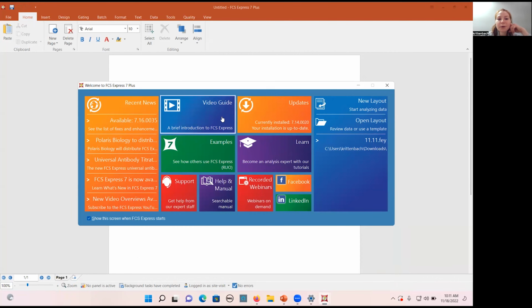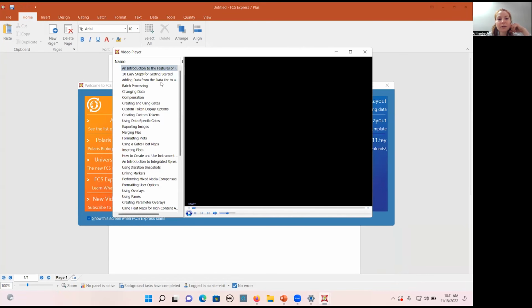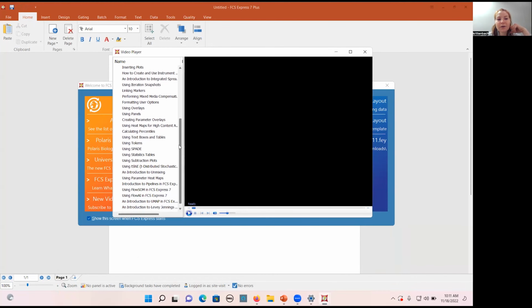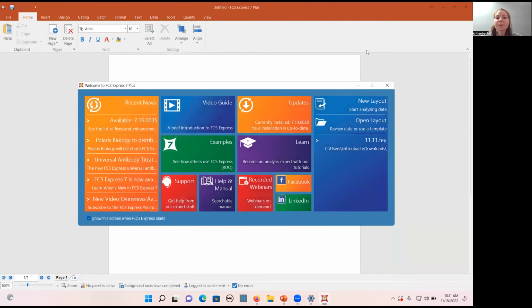We're going to see this video guide here, which is actually a video player, and we have a whole list of videos that are 2 to 3 minutes long. They give you a really quick overview and step-by-step instructions on how to get started with any of these tools, so it's a great reference to have here.